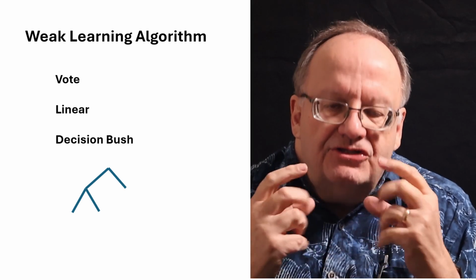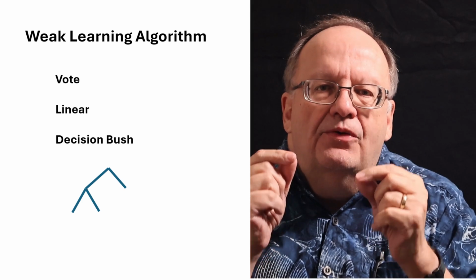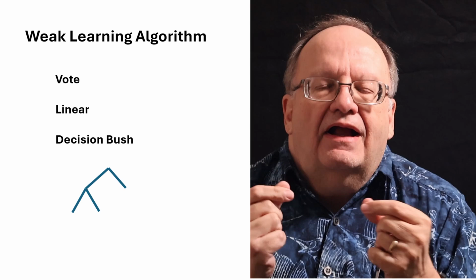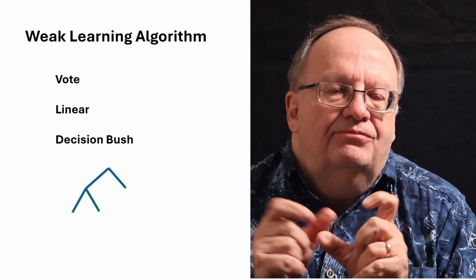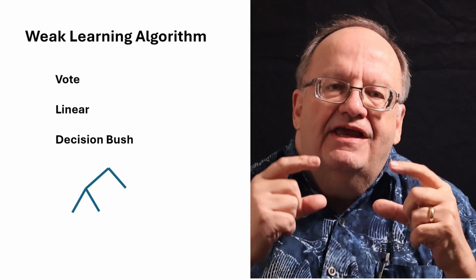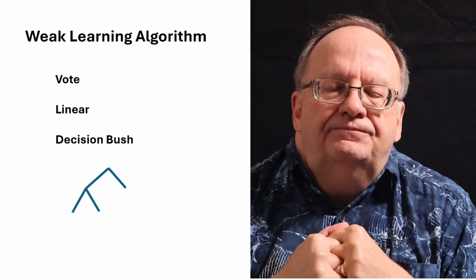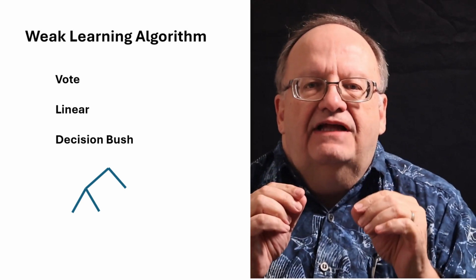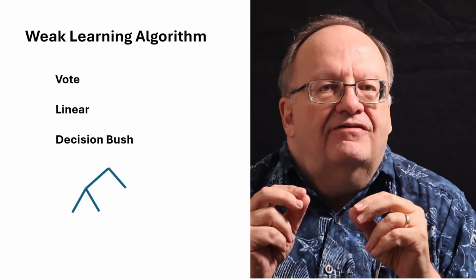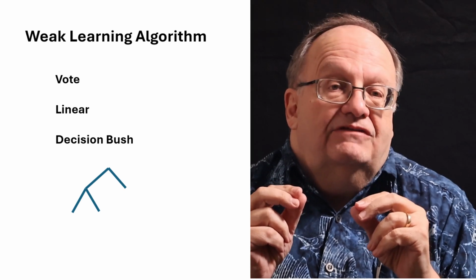So what we're going to do is constrain this tree. It's a simple thing. When we reach a certain node that has fewer than 10 or 20 examples, we're not going to continue, even though it hasn't completely decided A versus B. This keeps the tree from getting very deep. Hence, it's a bush. It will learn more complex things than simple linear or voting, but it will give a really good identity of the molecules we made our choices over, and it's relatively efficient.